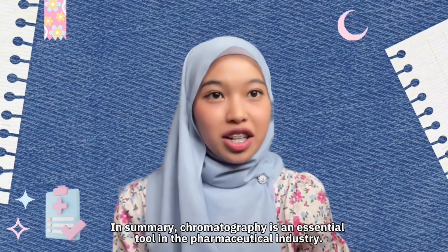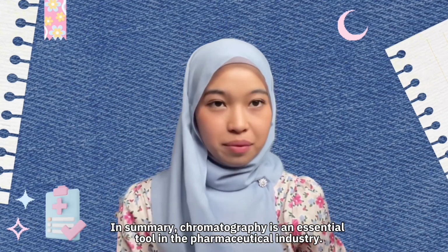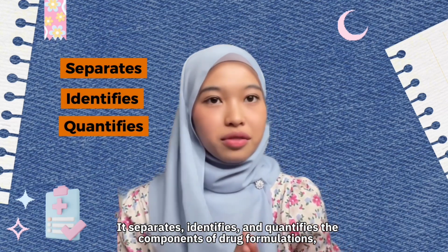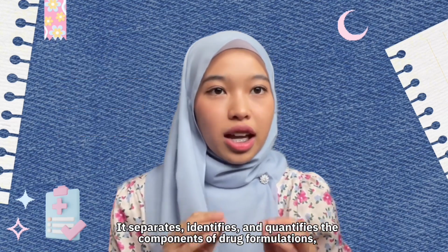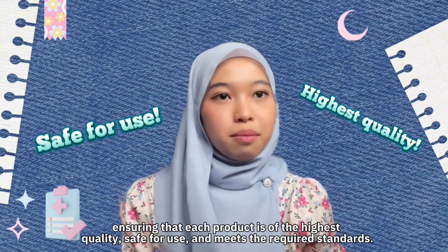In summary, chromatography is an essential tool in the pharmaceutical industry. It separates, identifies, and quantifies the components of drug formulations, ensuring that each product is of the highest quality, safe for use, and meets the required standards.